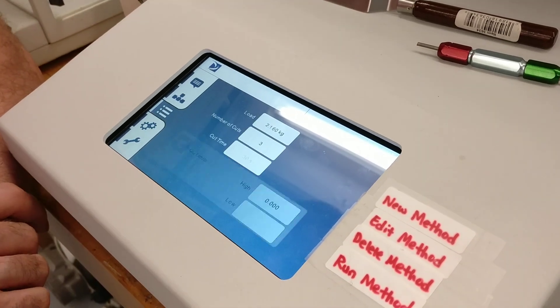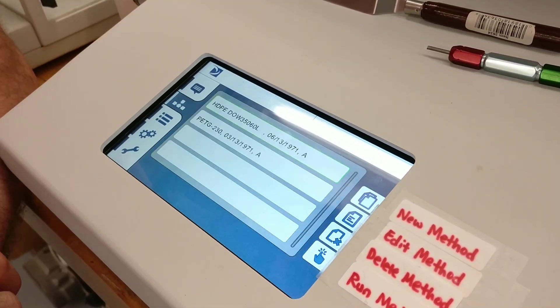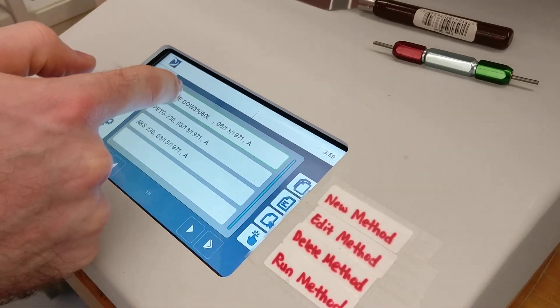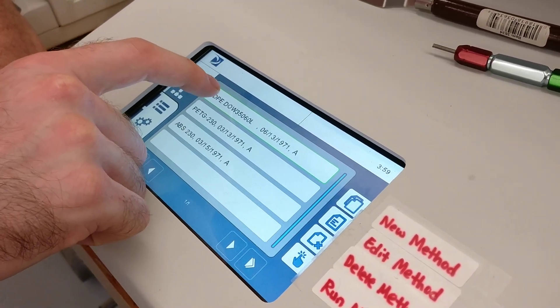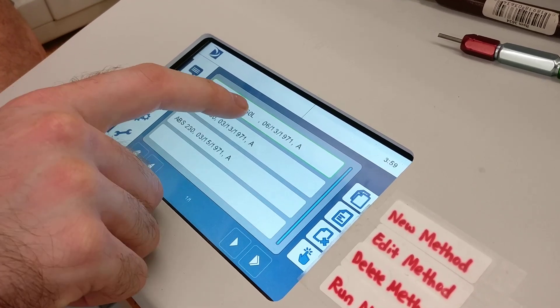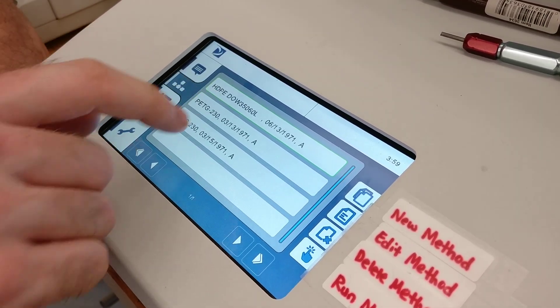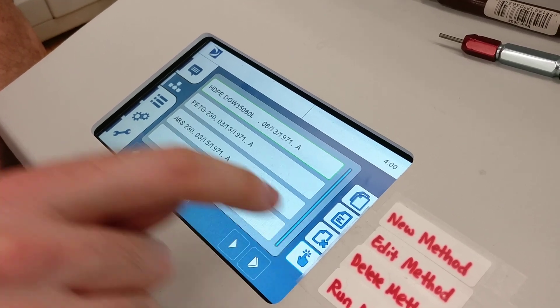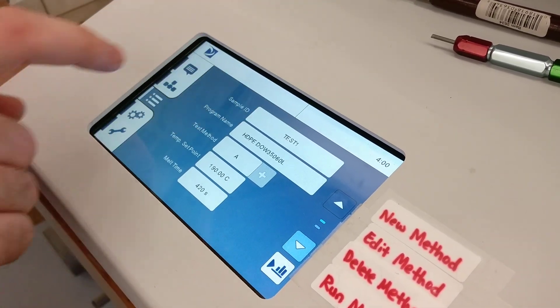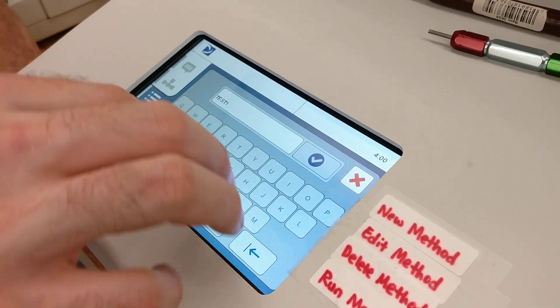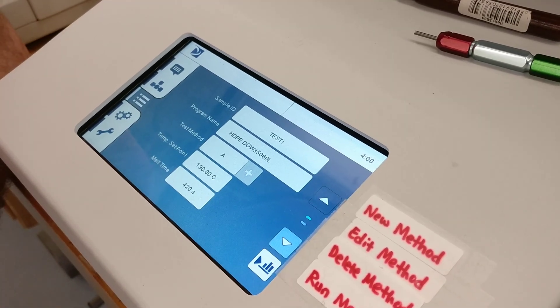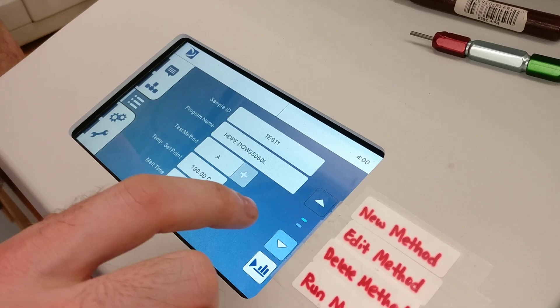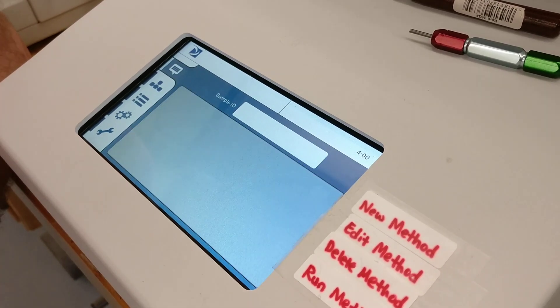Go back to the second one and you'll see your list of methods here. We're going to be testing high density polyethylene, and this is the spec for that. The bottom right button will run that method. In this top box, you can put in the name of your sample. Then we can run the method with this bottom right button.